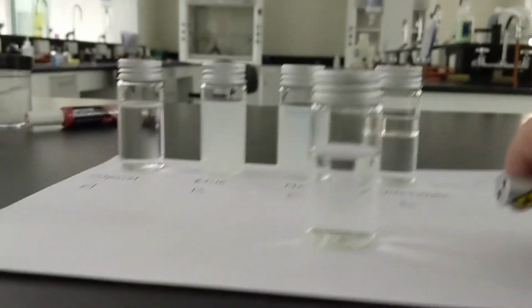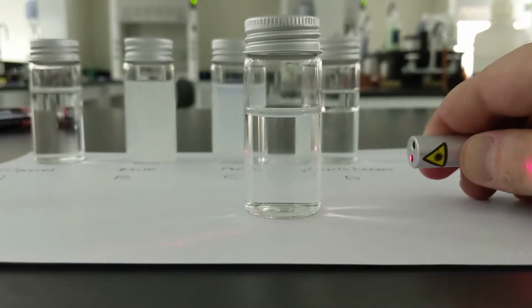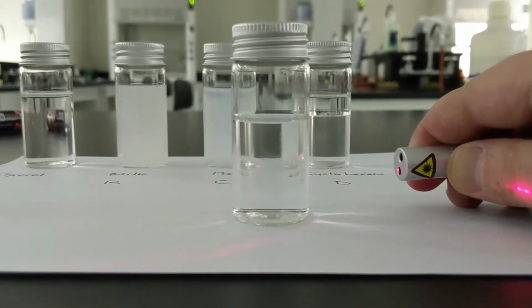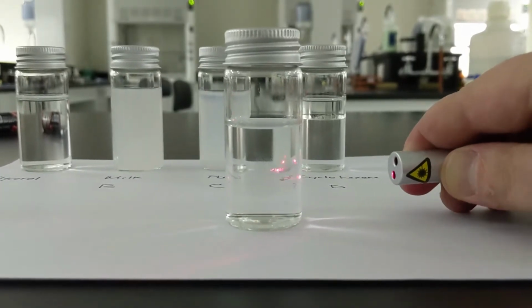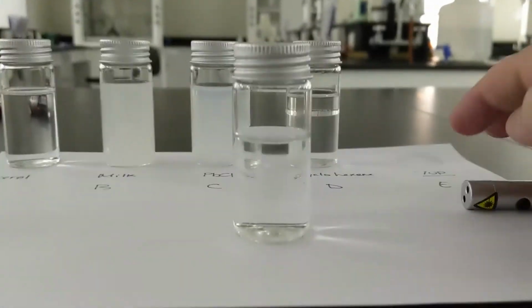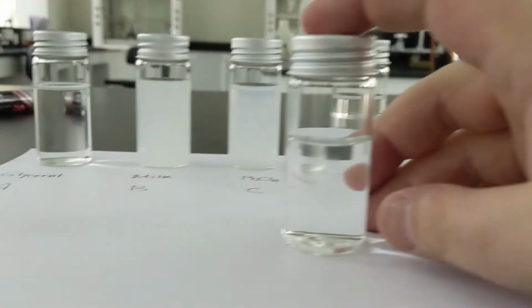Okay, the 7-Up. Now this is an interesting one. 7-Up, let's shine my light through it. It's looking a lot like water, right? I don't see anything happen here. This is full of carbon dioxide, but carbon dioxide is a clear and colorless gas, and I'm not seeing any refraction here. This is apparently looking like a good homogeneous solution.